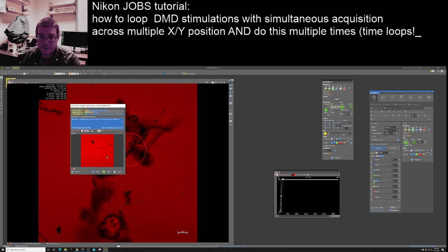Basically it's going to visit each one of these points. Then we see the light come on, and then it turns it off. Then it's going to visit the next point, turn the light on, turn it off, visit the next point, turn the light on. Oh, whoops, we did only 3 points. So now we're at the stage where it's going to wait 30 seconds before implementing the next loop. And so it's going to wait 20 more seconds.